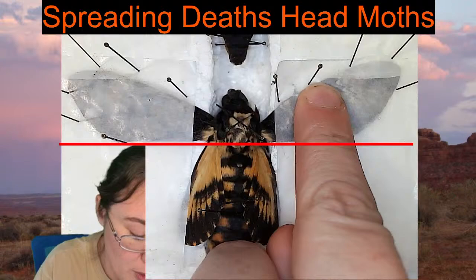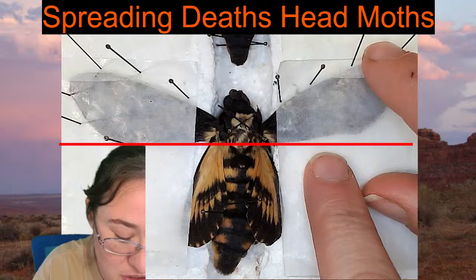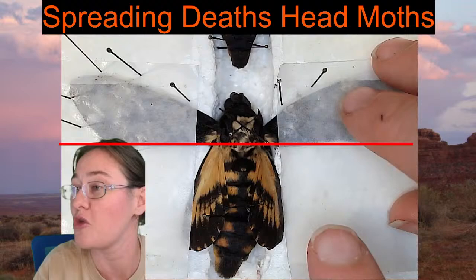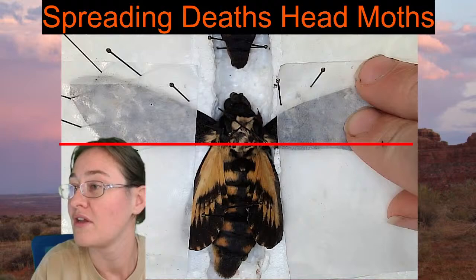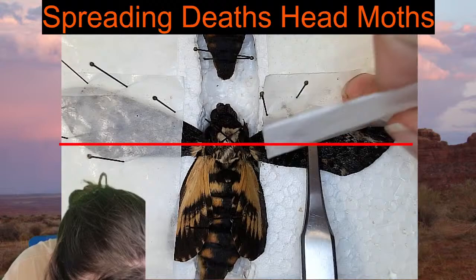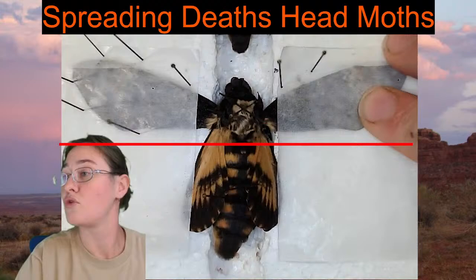But like I've said before, when we are spreading moth's wings, it's easier to let it come down naturally just a little bit than it is to go back in and pull it up. So if I just let it go a little bit, it will bounce down naturally. There we go. Did I let it go too far? Yeah. Good. So now I'm going to pin all the way around these wings.